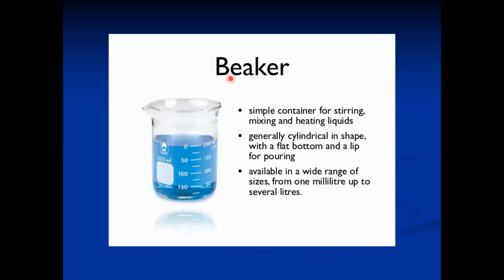So first one is the beaker. Beaker is having multiple uses. The photo of the beaker is in front of you. Generally, it is a simple container which can be used for mixing and heating the liquids.